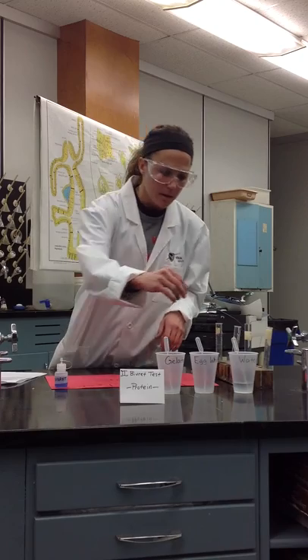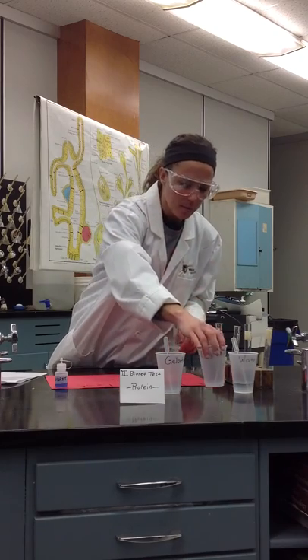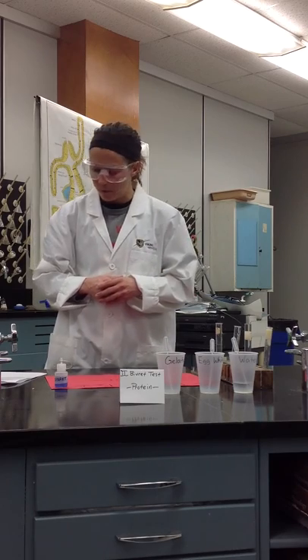It says to wash your test tubes and, if necessary, label them again. To test tube number 1, you want to add a dropper full of egg albumin, also known as egg whites. That will be found in one of these cups. And again, I'm not going to put these in there because I don't want to waste some of our material.